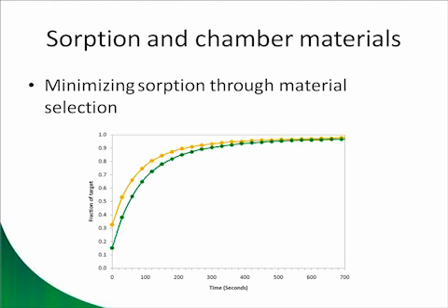Pat? Thanks, Jason. One of the things that does play an impact on the chambers is how large they are, and that will impact whether you need to include additional fans and mixing. So what size chambers are you looking at making for your custom chamber?